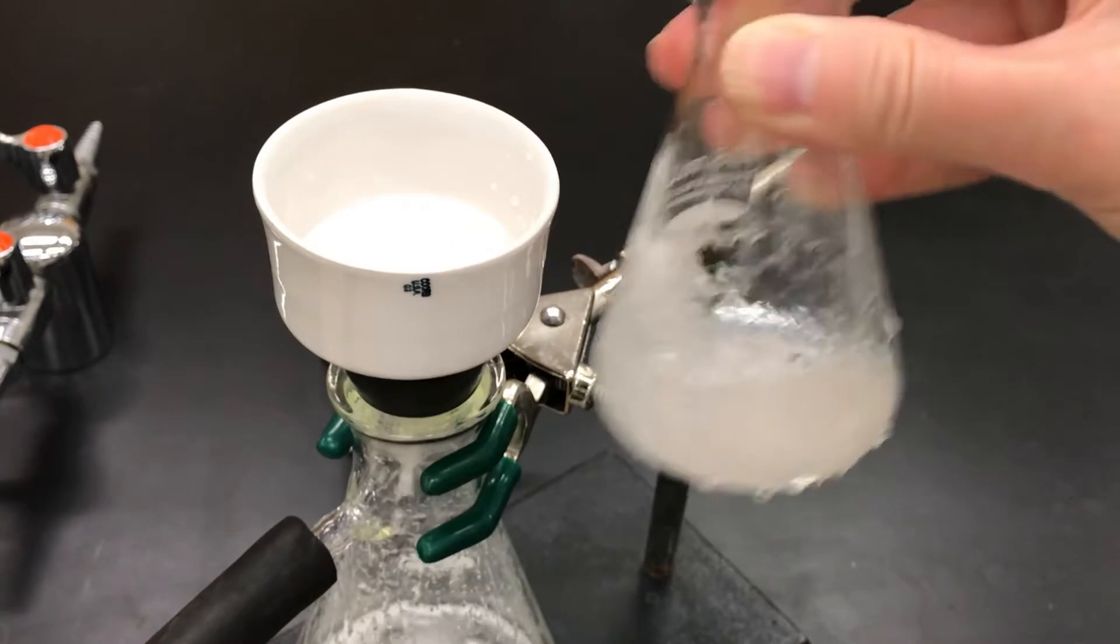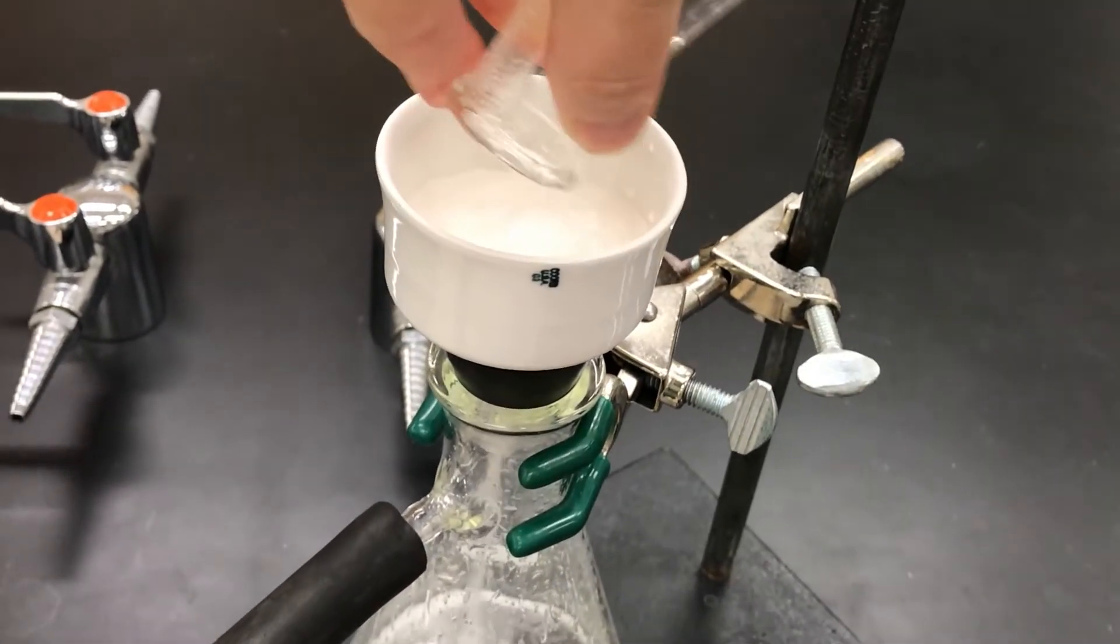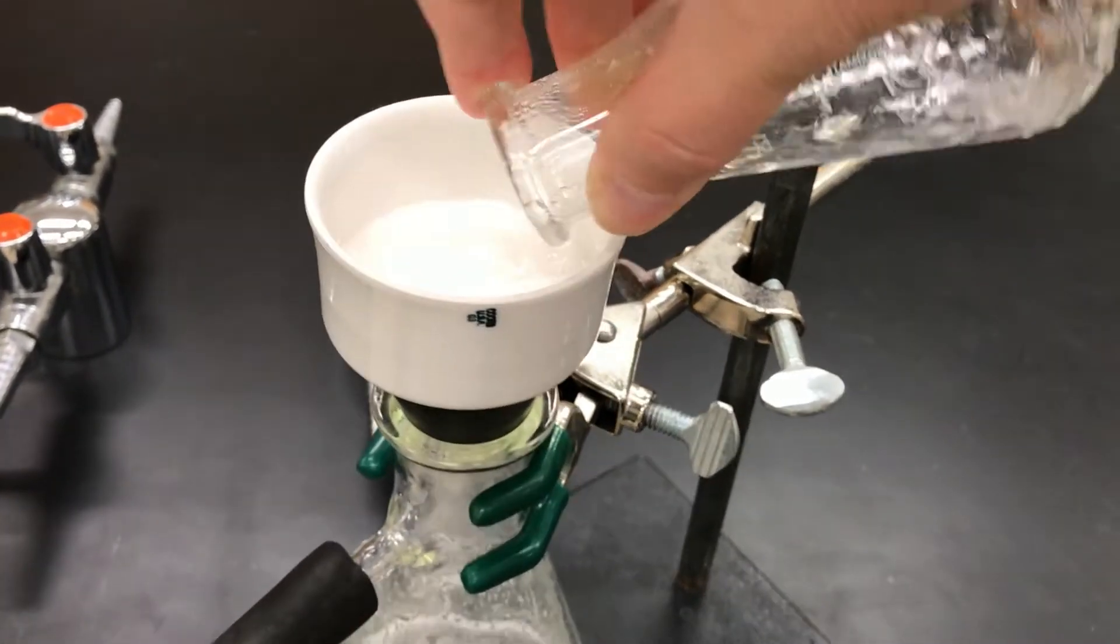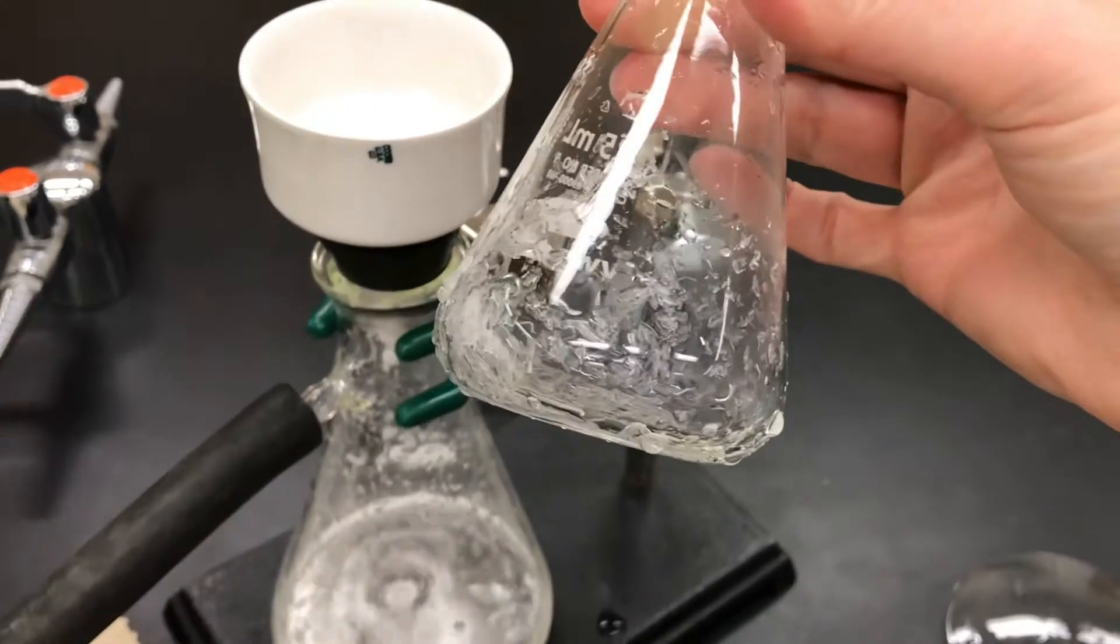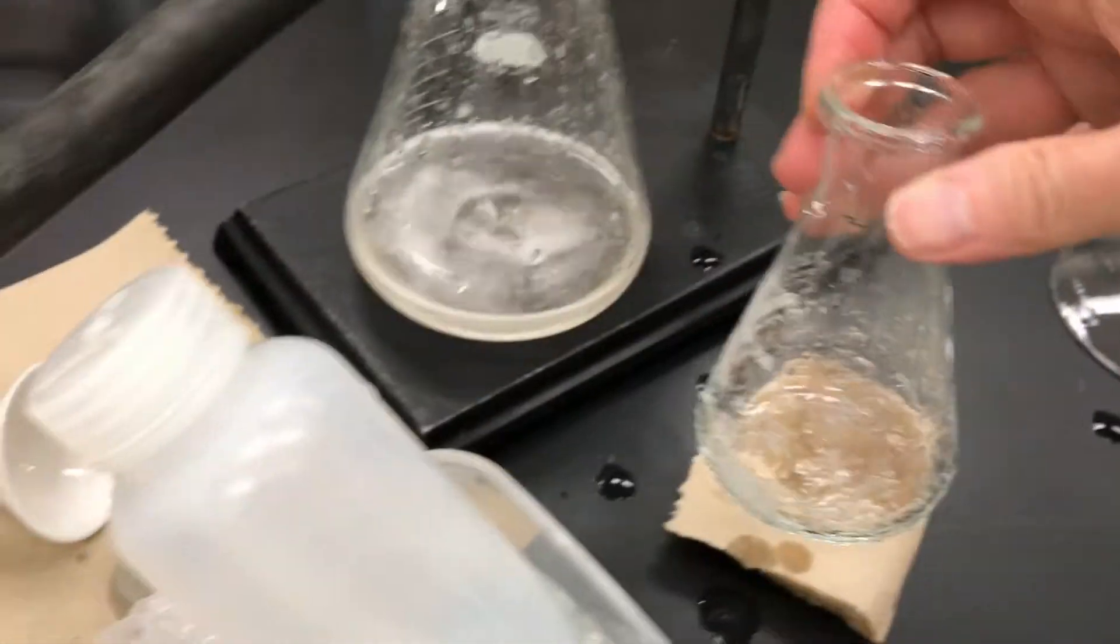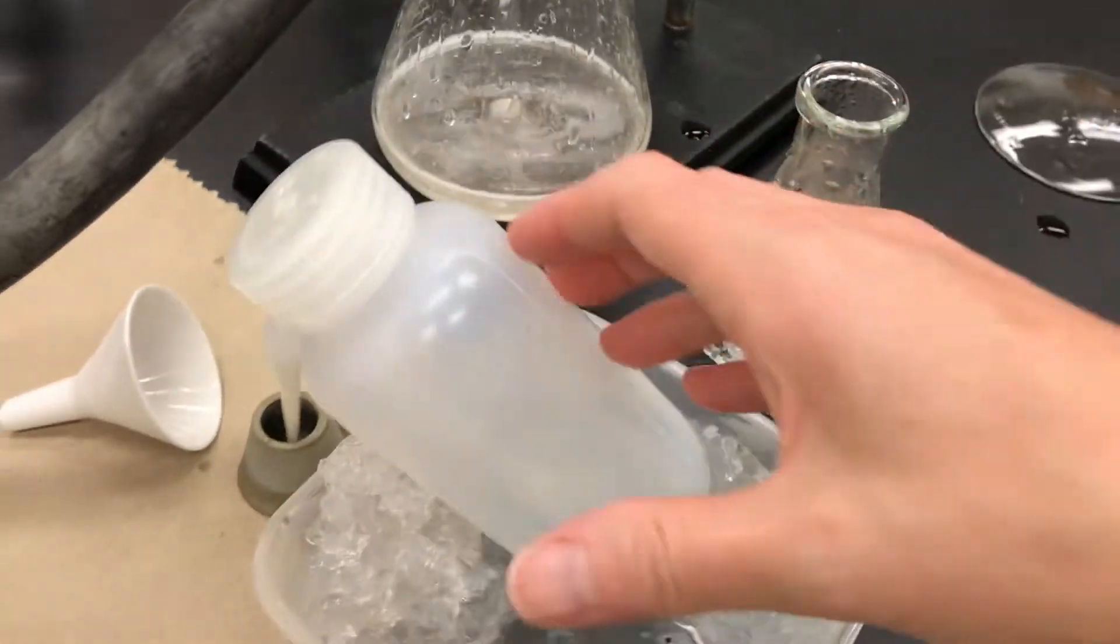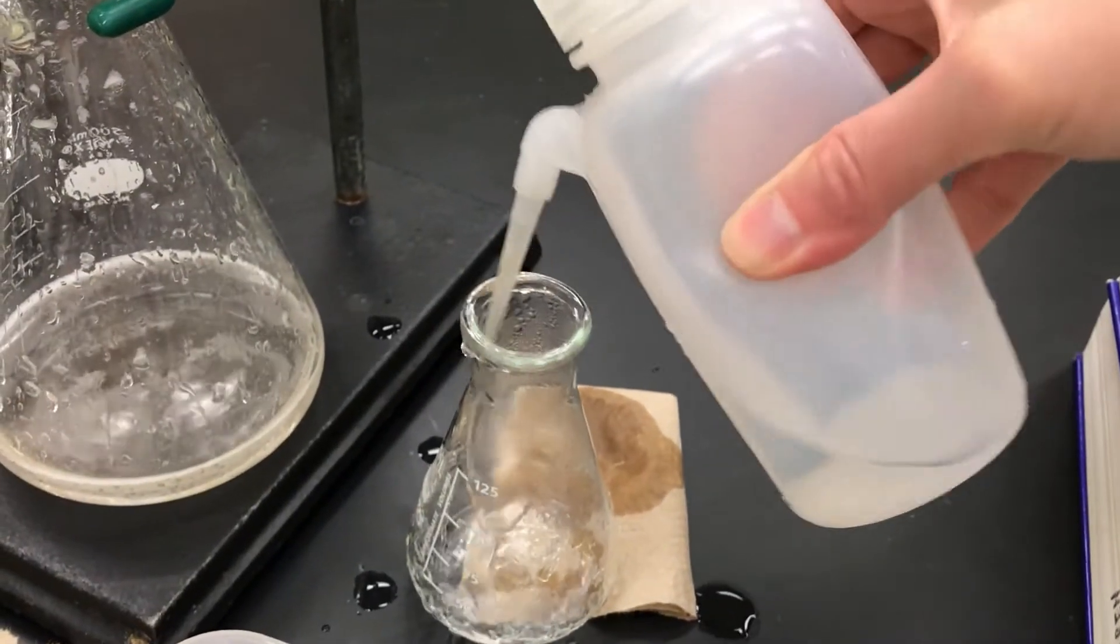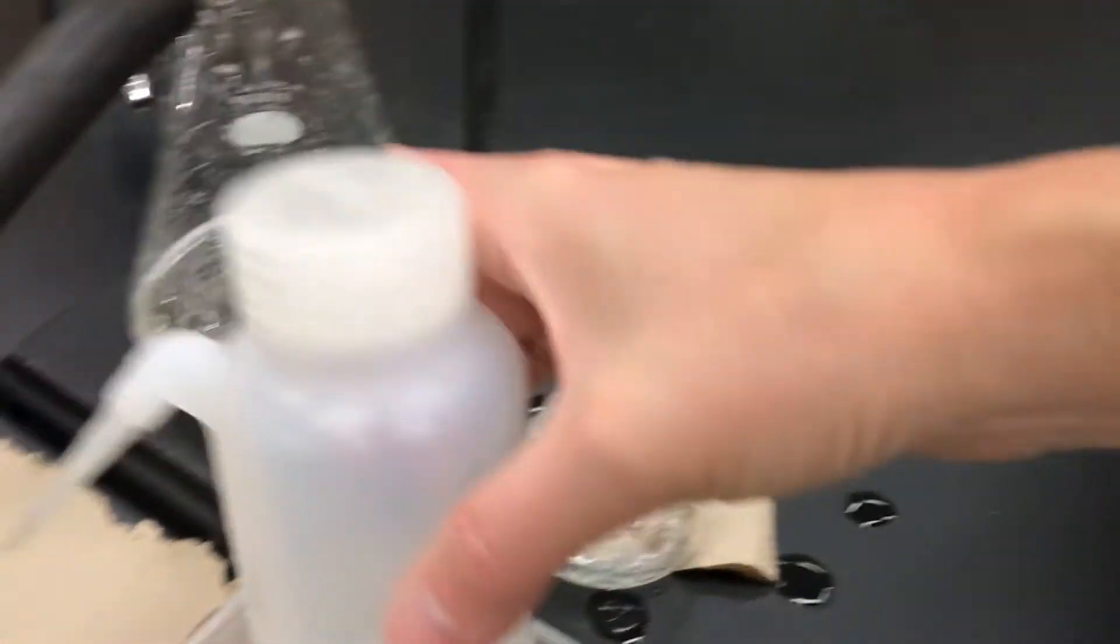And we do want that solid out of the flask. So swirl it and dump it to get it out. There's going to be some solid residue that's probably left and I would give it at least one rinse because I do want to get as high yield as possible.